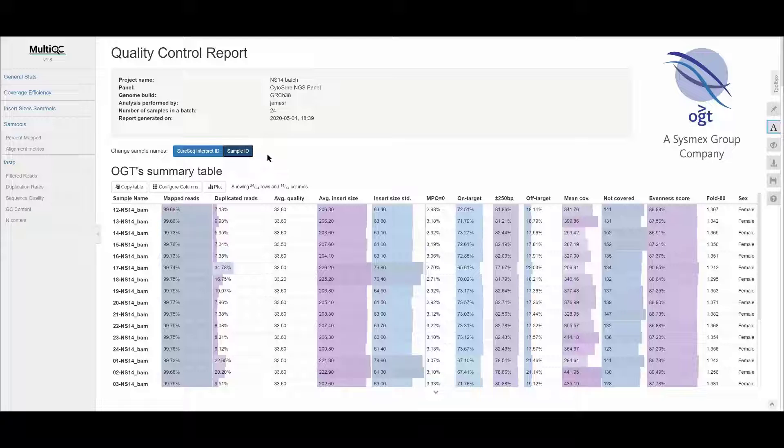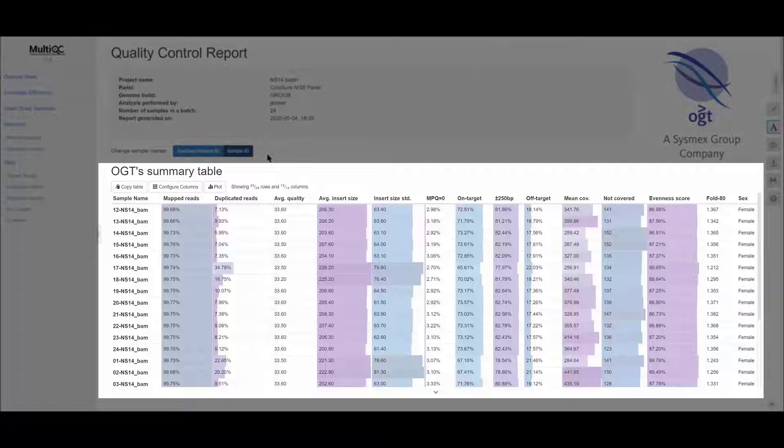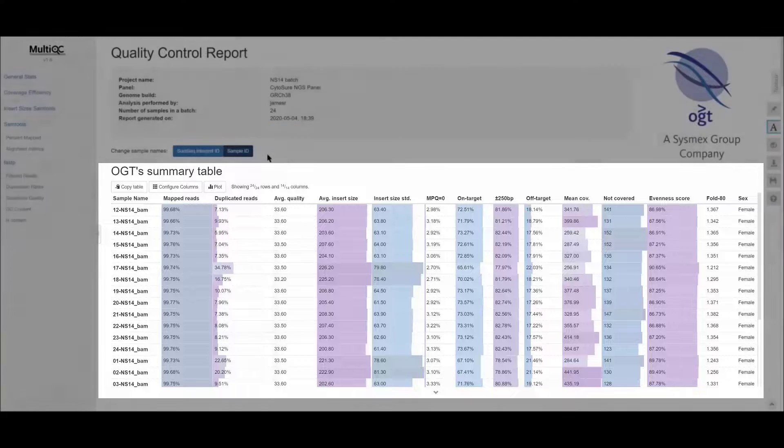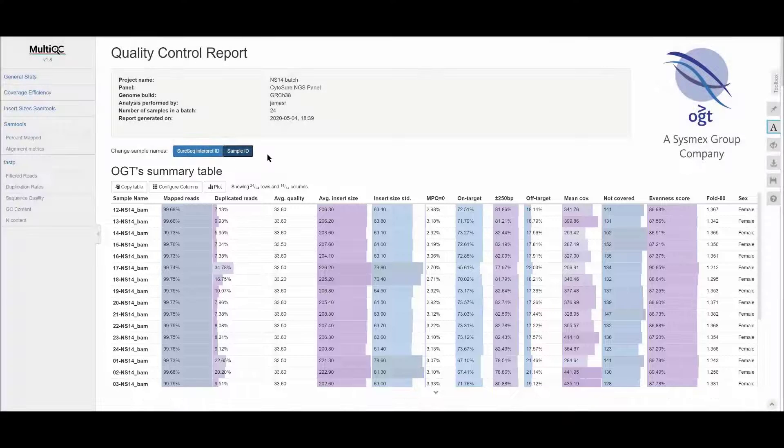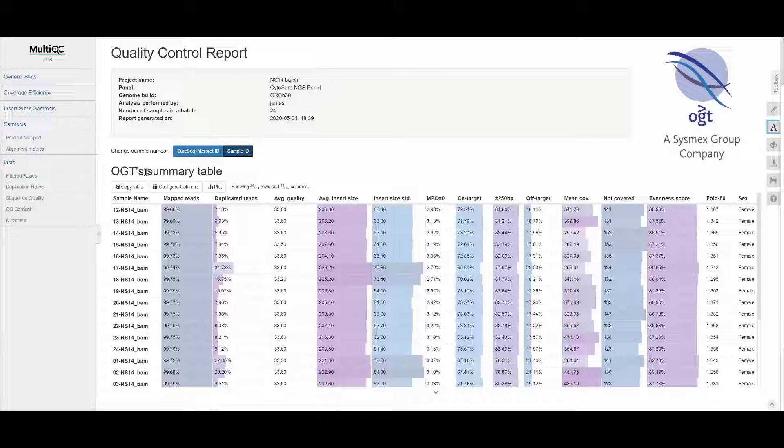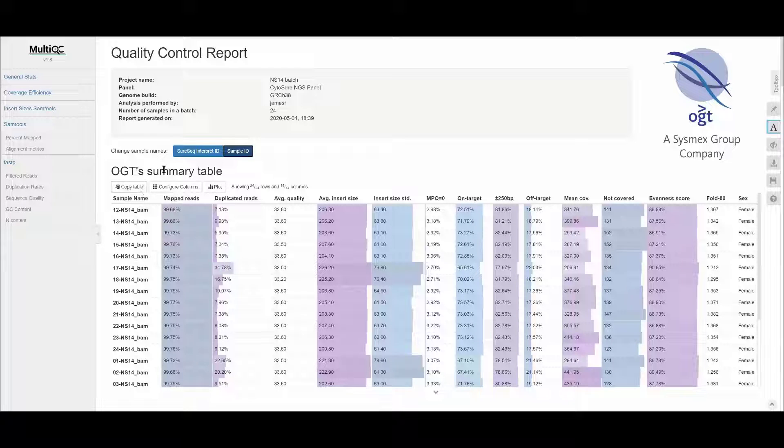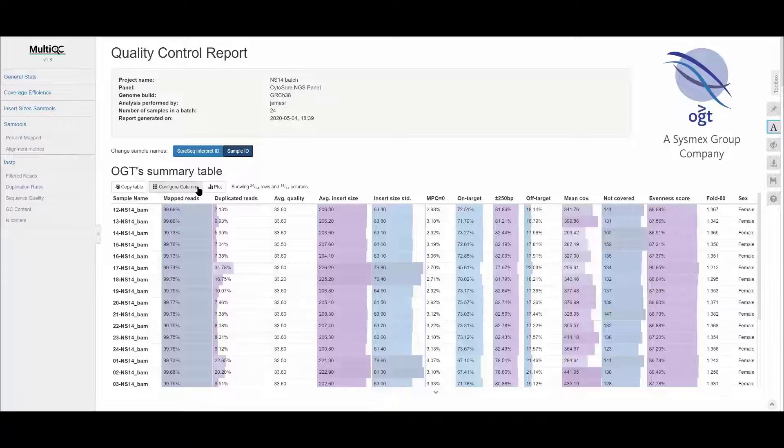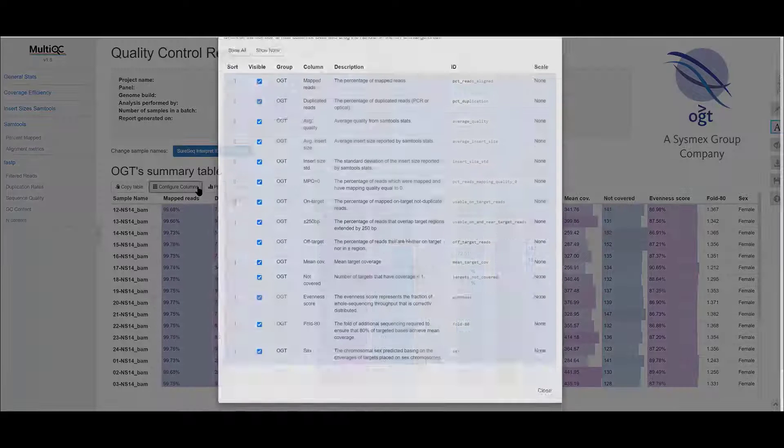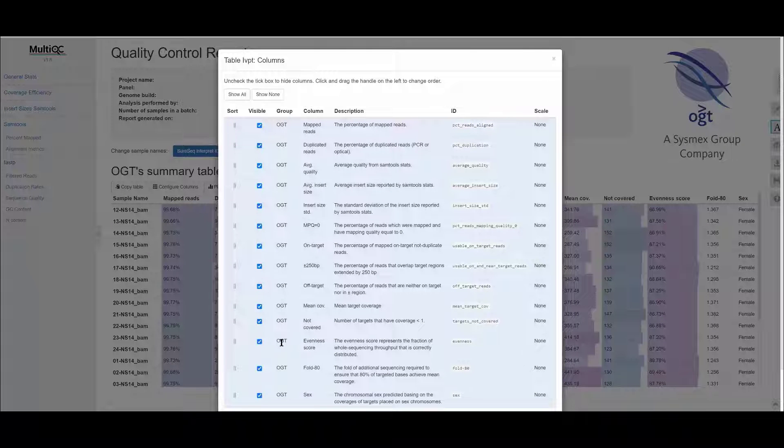The first table in the report provides a summary of all the metrics that have been collected from the analysis tools. The data from this table can be pasted into your clipboard by clicking on the Copy Table button, and you can change the order or display of the columns by clicking on the Configure Columns button.